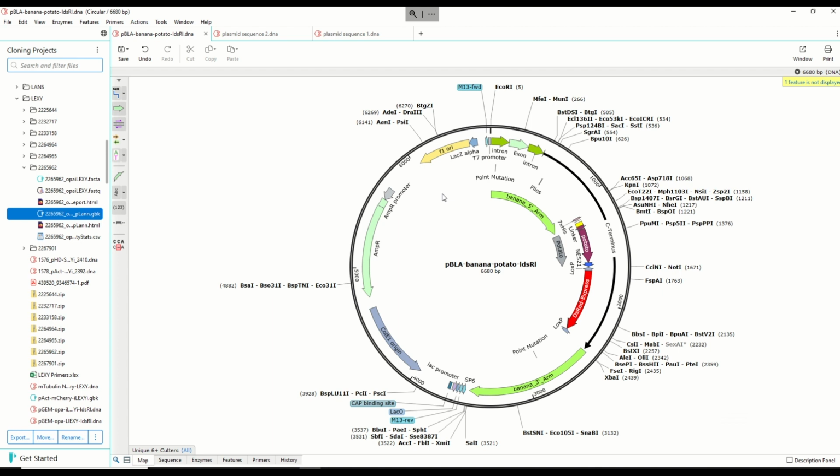But the free version of SnapGene doesn't have the sequence alignment feature enabled. After that, we'll do Benchling, which is free, an online tool. And then after that, we'll go old school and just do BLAST alignment and have a look at what that looks like.